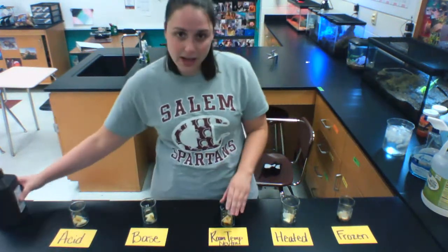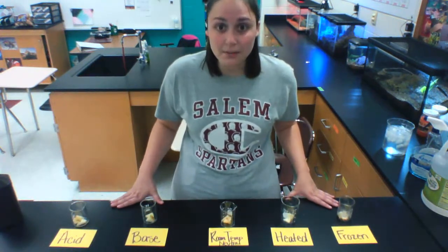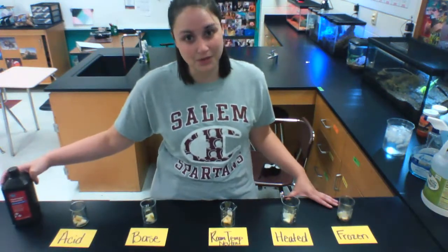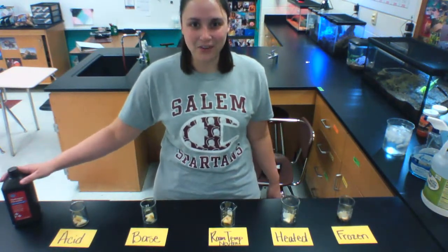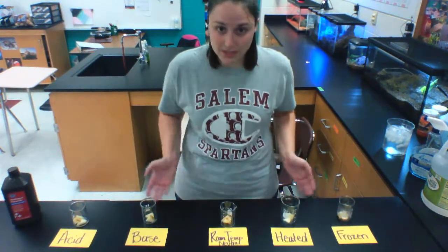And potatoes have a different enzyme called peroxidase, and that enzyme speeds up the reaction of breaking down hydrogen peroxide so that it will not damage the potato cells, in theory. I mean, these potatoes are goners, but hey, we're going to see how this lab works. So what I've done is I've done some different treatments to the different potatoes.